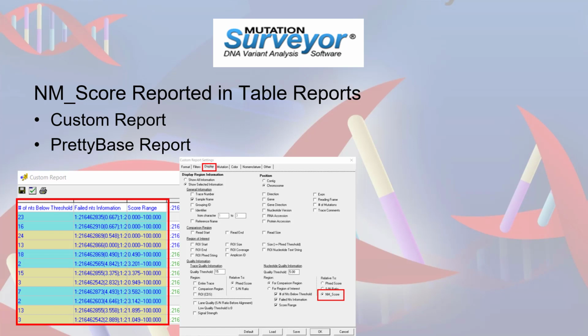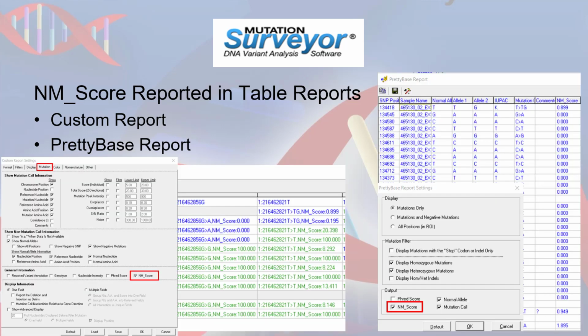The custom report can be used to report nucleotide quality information for the trace based on the NM score of each base within the selected region. Just like with the Phred score and signal-to-noise ratio, the custom report can report relative to the NM score for the selected region, how many nucleotides fall below your set threshold, the location of those nucleotides, and their specific score and the range of scores found for that region. Both the custom report and the pretty base report include the option to display the NM score for the mutation call or even for normal alleles in the custom report.